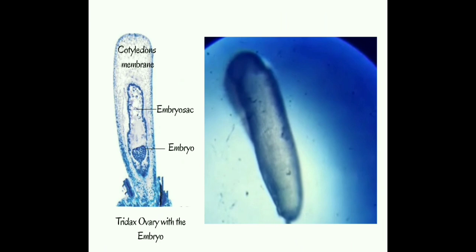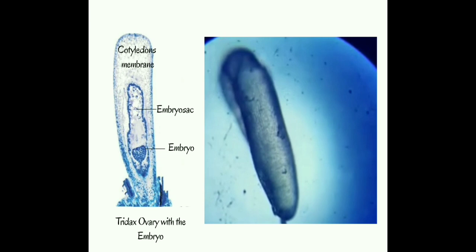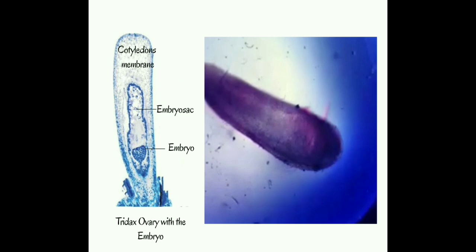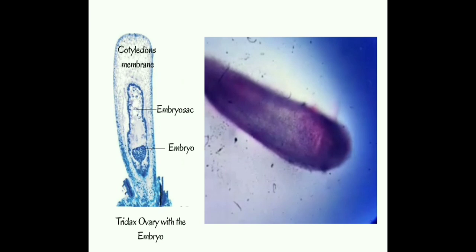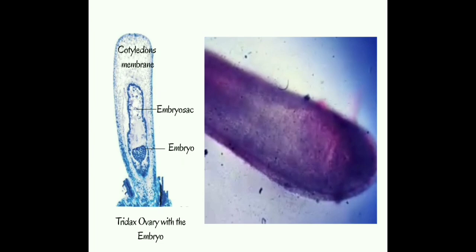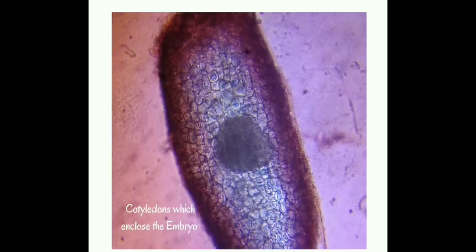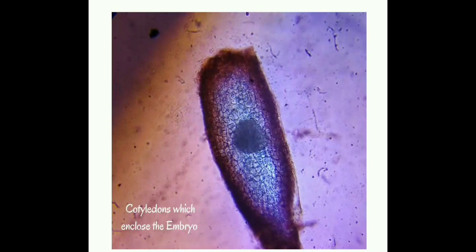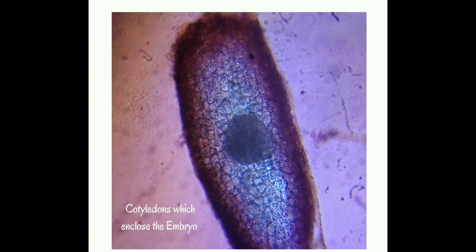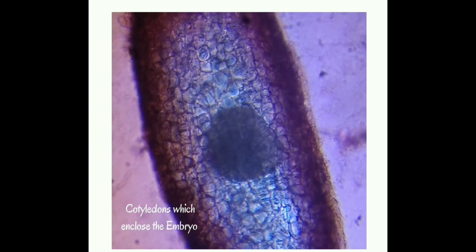This is the structure which is inside the ovary wall. We have the outermost cotyledonous membrane and the inner embryo sac, within which our embryo is placed. In order to mount the embryo, we have to break the cotyledonous membrane with the help of a needle. You can gently press or cut the tip of the cotyledonous membrane, then gently press at the base. The dark body present in the middle is the embryo. Cut the cotyledonous membrane and gently press at the bottom where the embryo will release into the water.